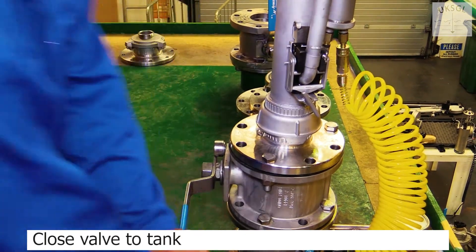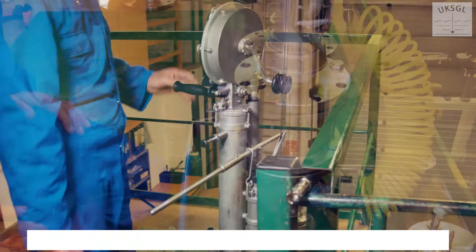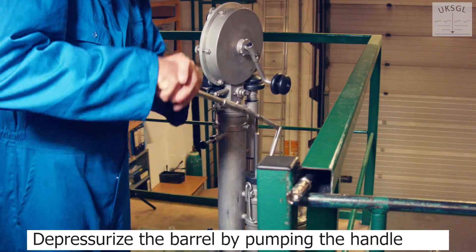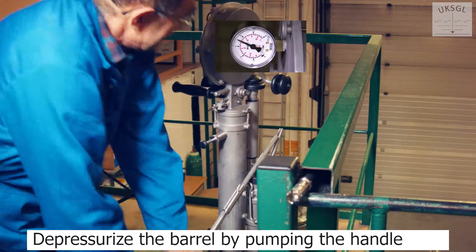Close the valve to the tank. Depressurise the barrel by pumping the handle until the gauge shows zero.